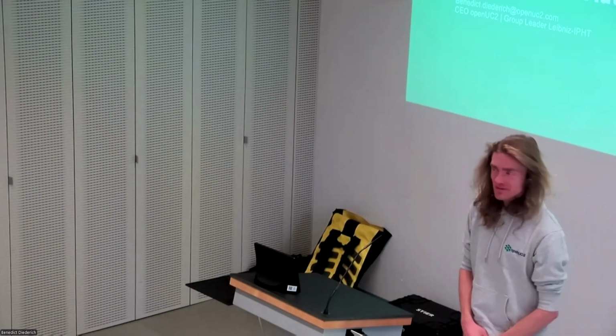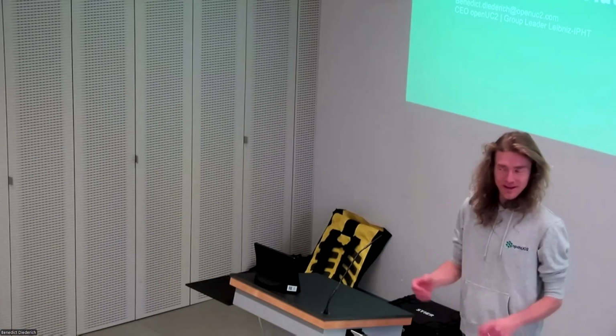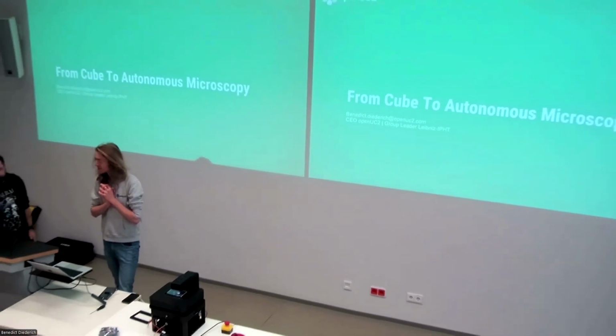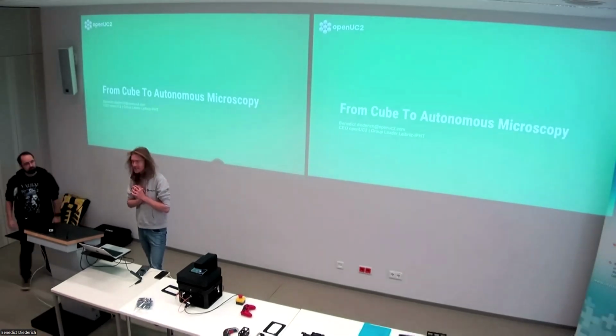Okay, so I think it will be very informal. If you don't mind coming one step further, it will be interactive after the talk, so you can also stay there for now. But thanks for giving us the opportunity to present our latest stuff.